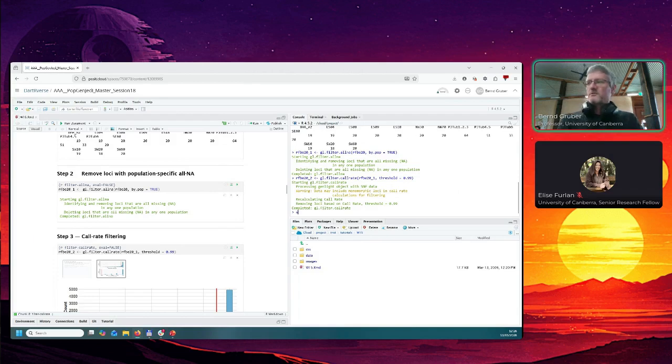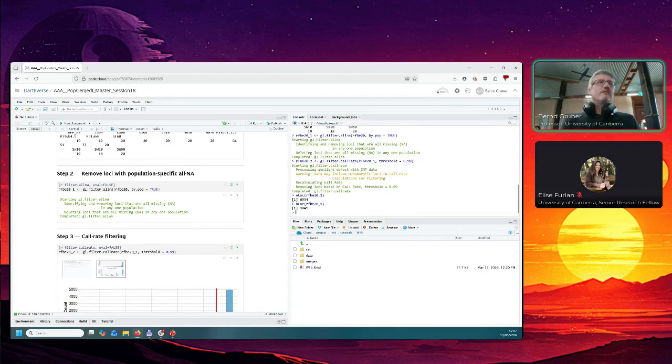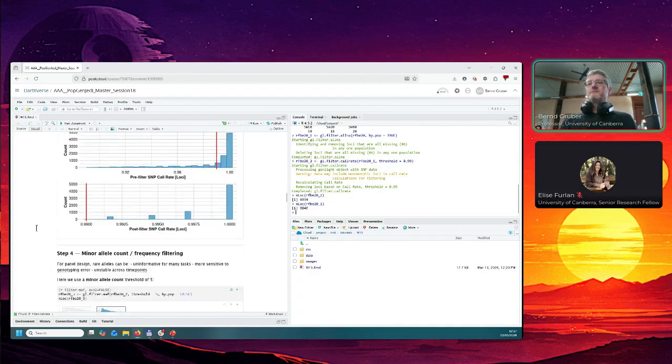And nothing stops you from checking that. How many do we have at the moment? At the moment we are at 6,000, and before we had 9,000. So we lost some, but who cares? So that was the call rate filtering.